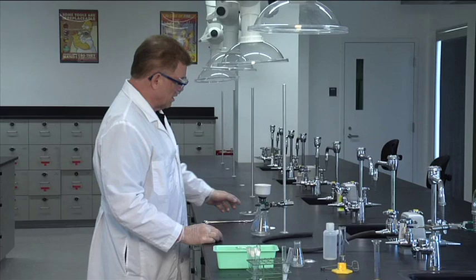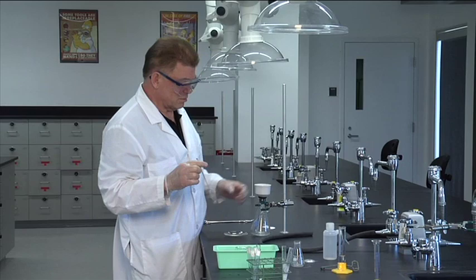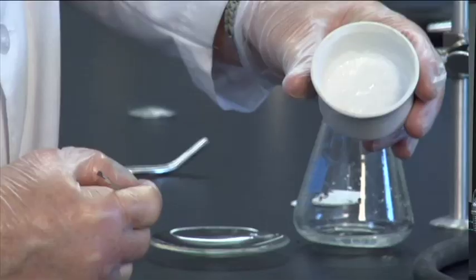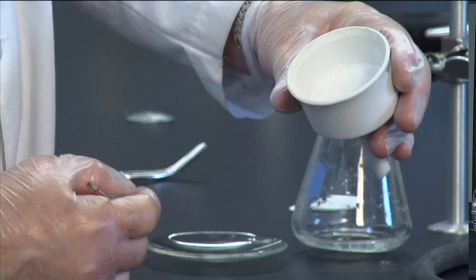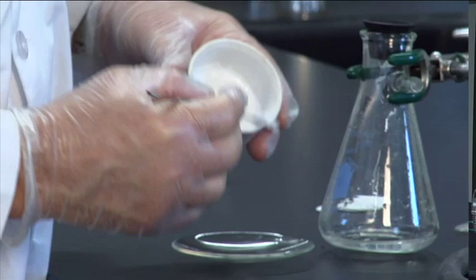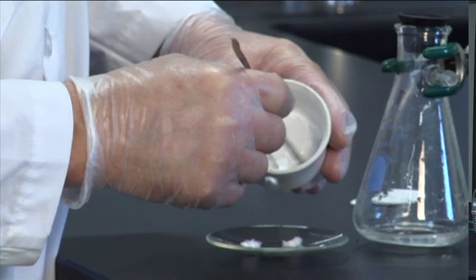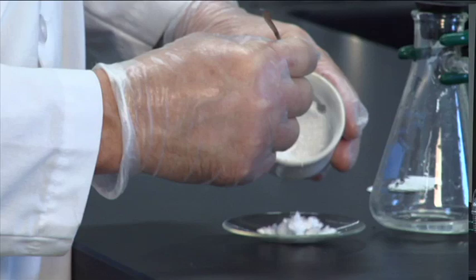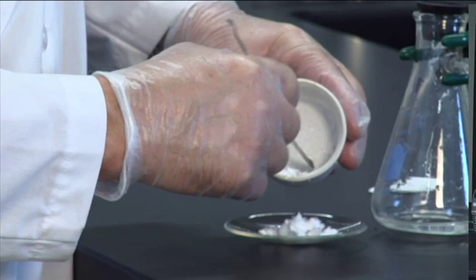I want to collect the crystals. I can do that on a watch glass with a spatula. Take a look in there. Maybe you can see those crystals. You may be too far away, but those are long white needle crystals. And I can scrape them out like this. This is one way to do it. Or I can just put the spatula underneath the filter paper and lift the filter paper out with all the crystals on it.